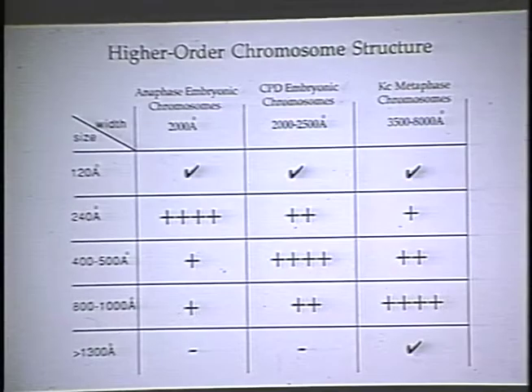And this is a critical point dried Drosophila chromosome, which was taken in the high voltage microscope here at Berkeley. Before we got the intermediate voltage microscope, we had designed and built a high tilt stage for the high voltage microscope so we could collect tomographic data there. Okay, and this just shows an example, and as you can imagine, these are incredibly complex, and to actually try to trace structures in them is quite demanding. What was clear from that early analysis was that chromosomes are built of a hierarchical arrangement of structures, and that the propensity or the density of these structures changes depending upon the cell cycle state.